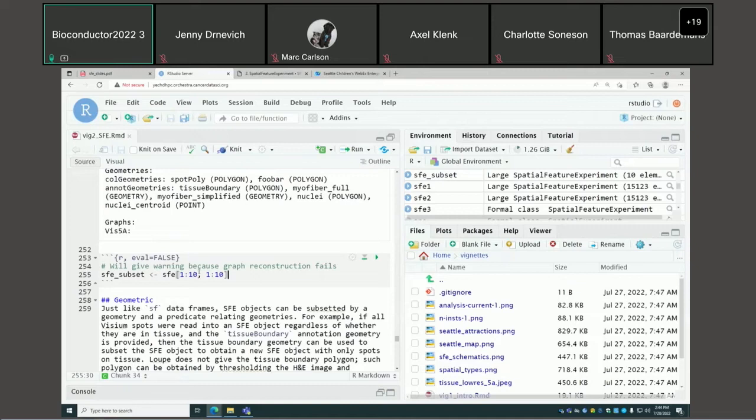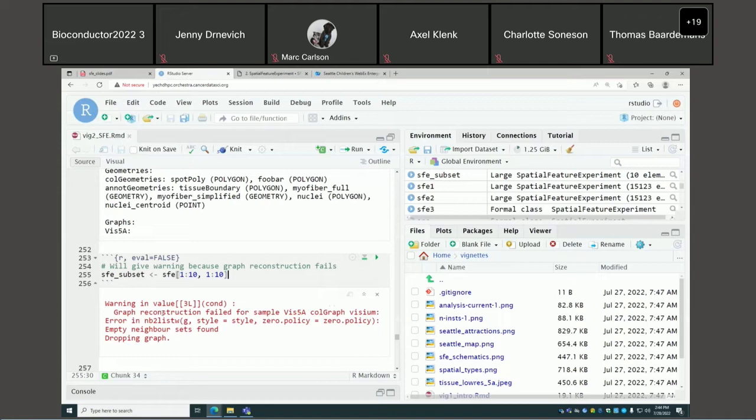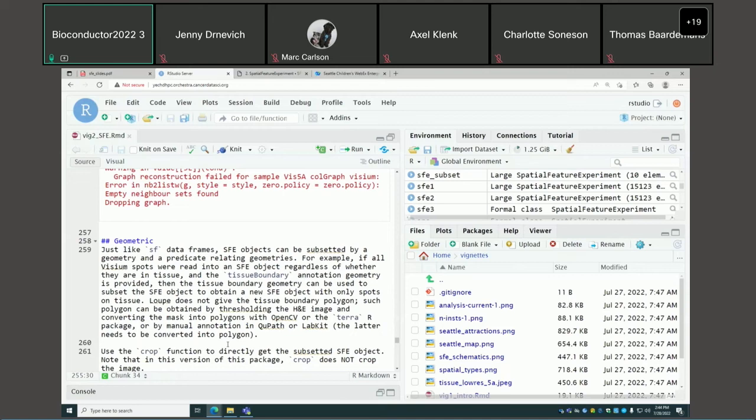If drop is FALSE (the default), SFE will try to reconstruct those spatial graphs based on the method and information recorded when you constructed it. However, if the reconstruction fails — say there's an error — you'll get a warning, and the graphs that failed to reconstruct are dropped.